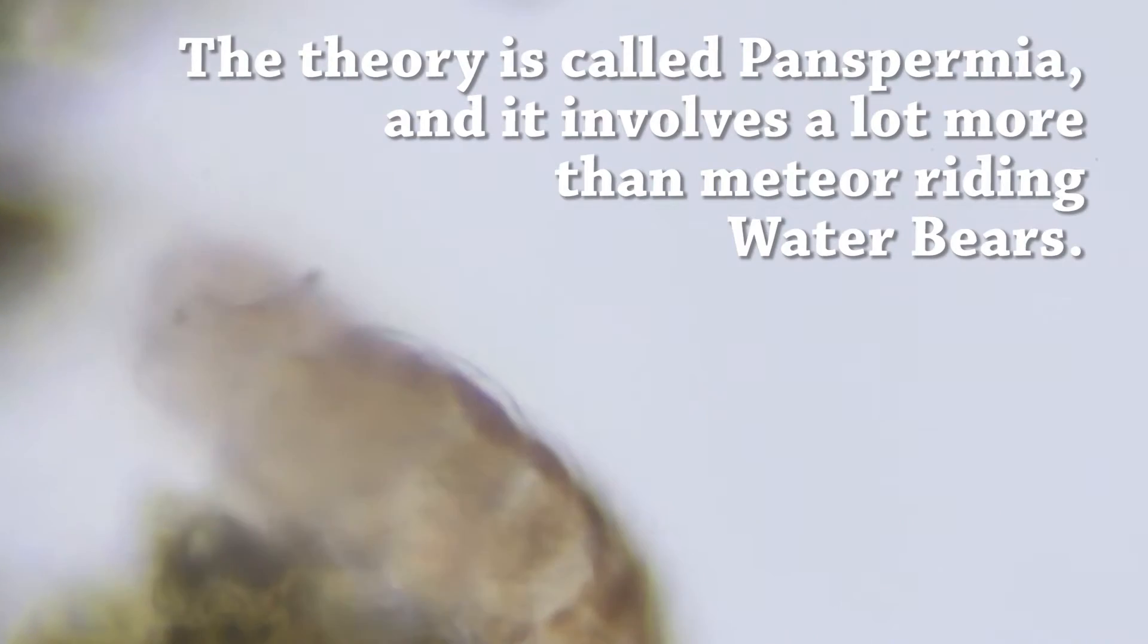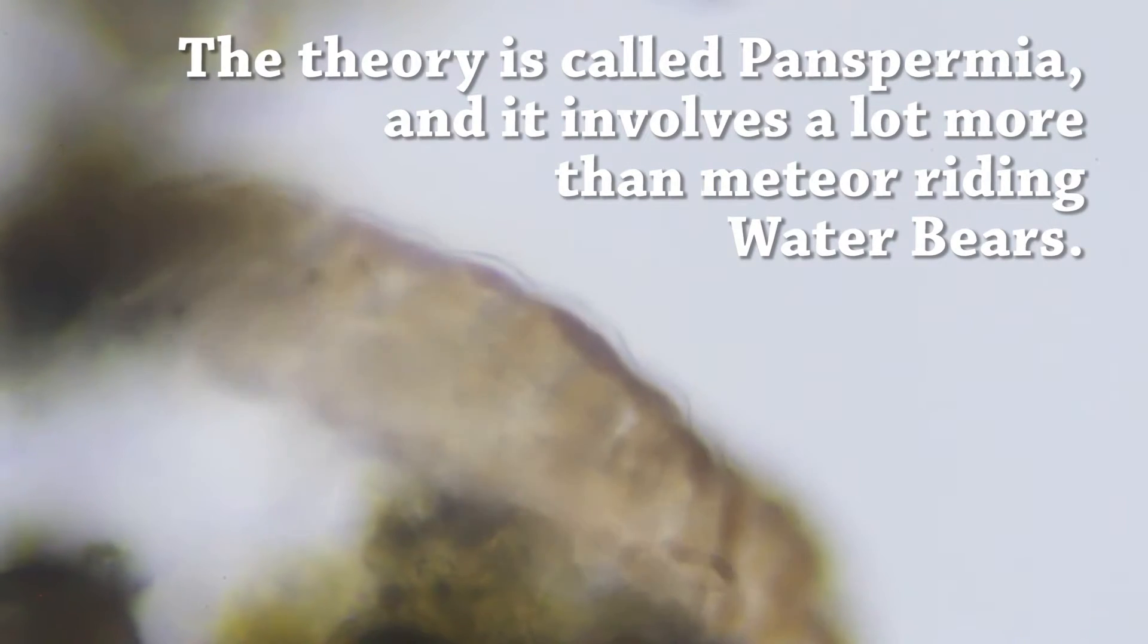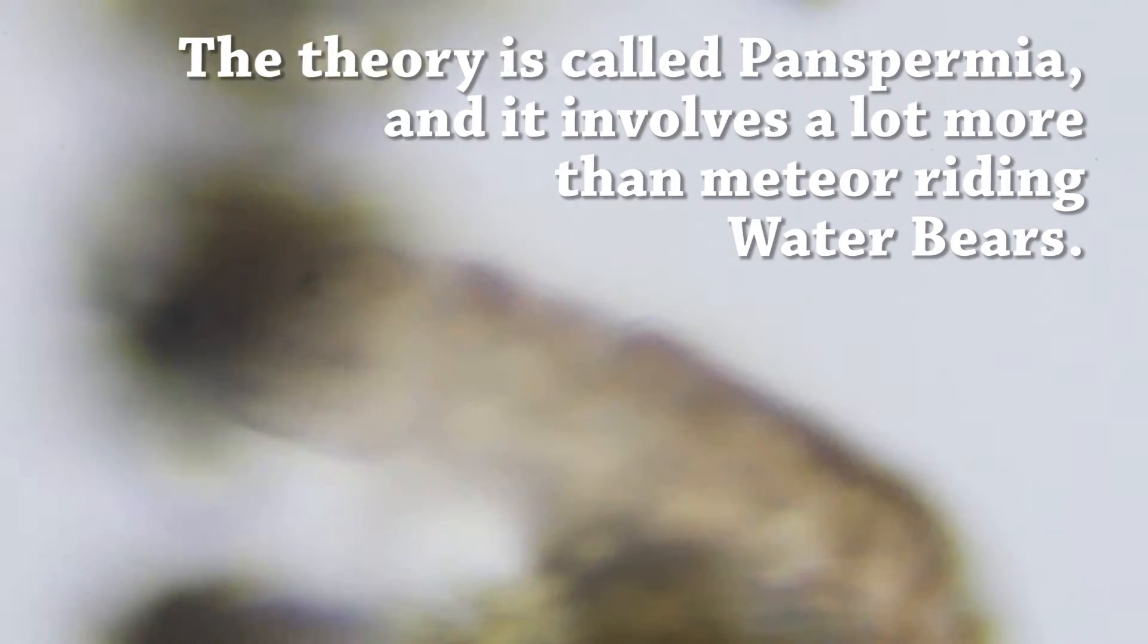Look at these, how cute! I love water bears. They're the best. They got weird faces. Weird little hands. They're not an endangered species. There's more water bears than there are humans, that's for sure. Water bears are all over.